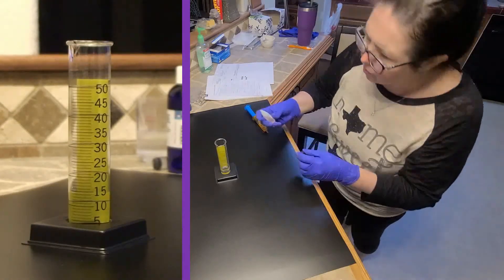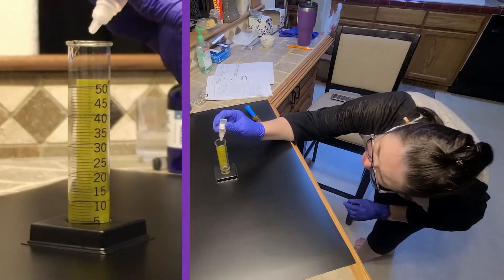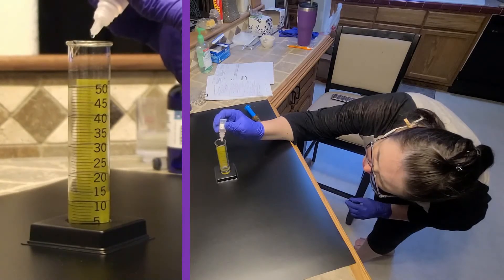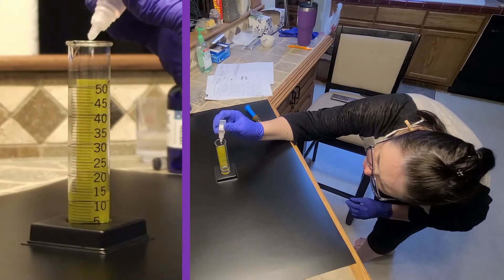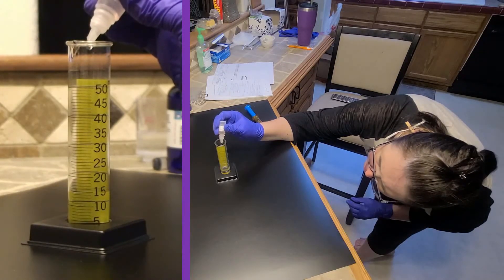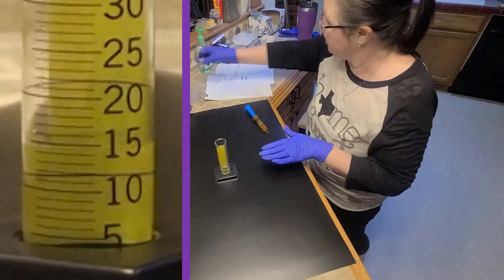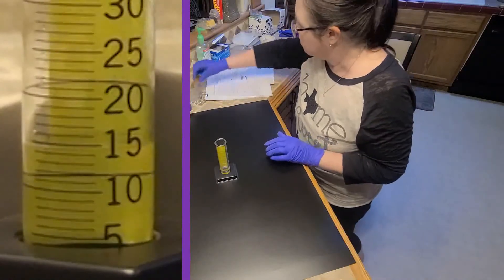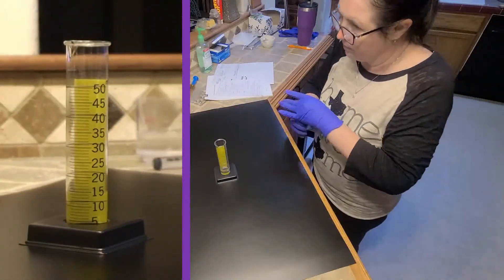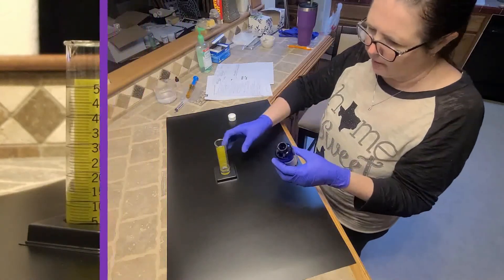And we're adding six drops of the orange flavoring. So that gives us our 15 milliliters. Now we're going to combine that with our powder.